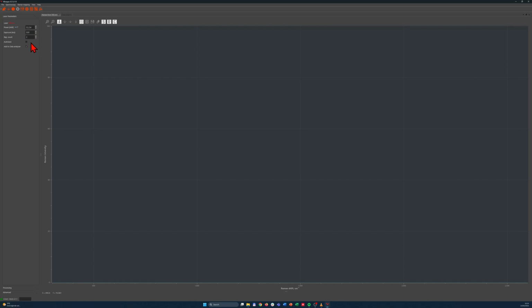So then what else? The buttons over here, connect, disconnect, we already covered that. Then laser on, off. Then this round button is capture the data. Then this cross is to abort the capture. Over here is to save the data. Over here, show hide the settings panel.